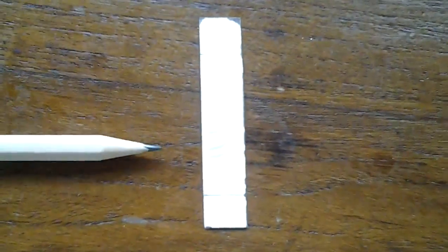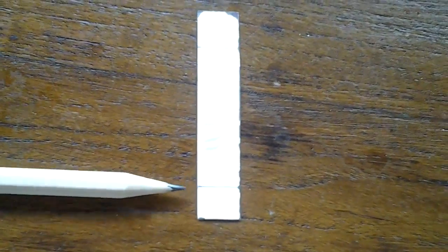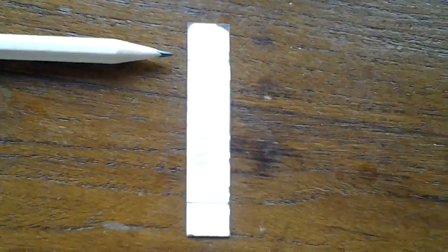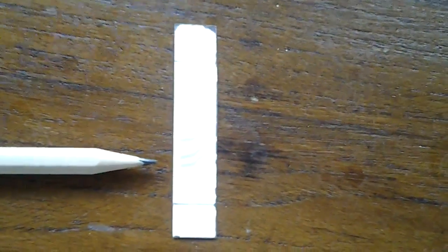So RF values are basically a measure of how far, as a proportion of the solvent front, those pigments have moved. So let me try and illustrate that by talking about this one here. We know that the starting line was this point here. The solvent front has travelled all the way up to here. The pigments travel varying distances. So if we were to take this pigment at the bottom here, if I measure how far it's travelled in millimetres, and if I then divide that by the total distance travelled by the solvent, I'll get the RF value. And that RF value is constant for that pigment. It shouldn't change, no matter who does the experiment, provided you're using the same solvent and the same surface. It will always move the same proportion. And that is required practical seven.